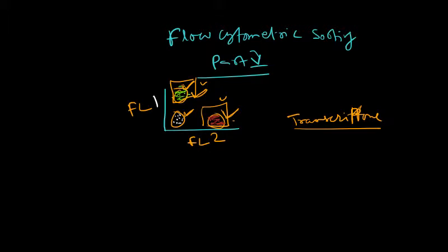So how does the sorting happen? By flow cytometry we can appreciate the three different populations. Now how can I get these populations? In layman's terms, I rely on the instrument, I do the gating. So this is gate 1, this is gate 2, and this is gate 3, and I tell the instrument, fine, sort the cells of G1, G2 and G3. Then the instrument can sort and separate them for me. So that is how I'm relying on the instrument. But how does the instrument perform this sorting?